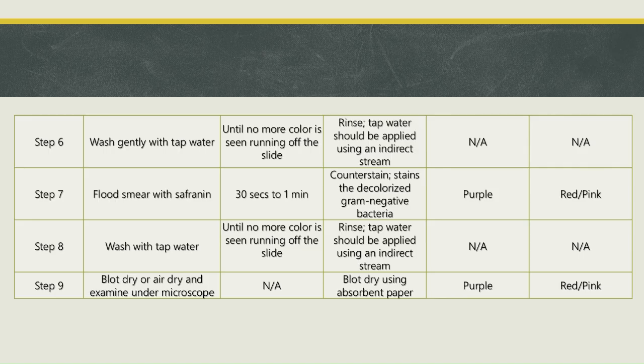Step 8. Reagent/action, wash with tap water. Time, until no more color is seen running off the slide. Function, rinse, tap water should be applied using an indirect stream.